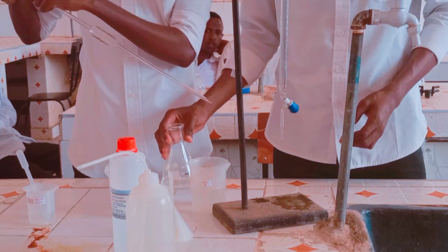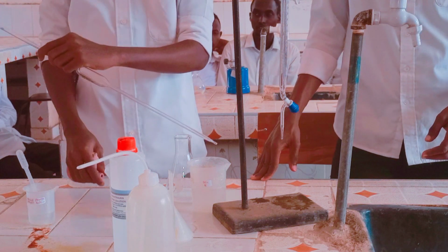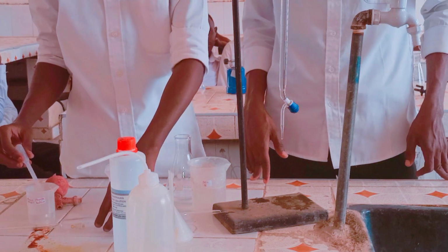Then from there, we add 3 drops of phenolphthalein indicator into the solution in the conical flask.